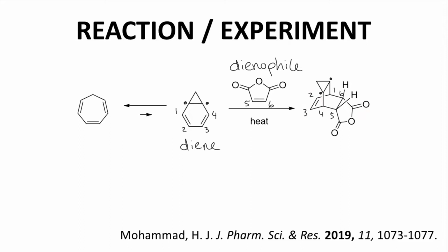The setup for the reaction is very simple. We just combine both reagents, cycloheptatriene and maleic anhydride, together with no solvent and heat them together for about 2 hours. There are many variations for the reaction procedure. I am demonstrating the procedure from the reference in the bottom corner.